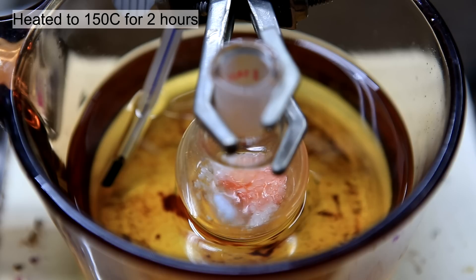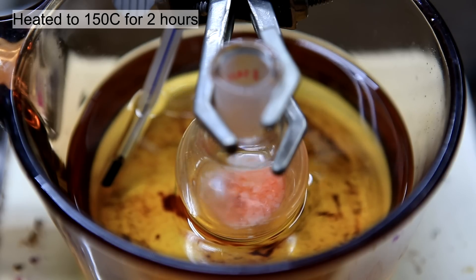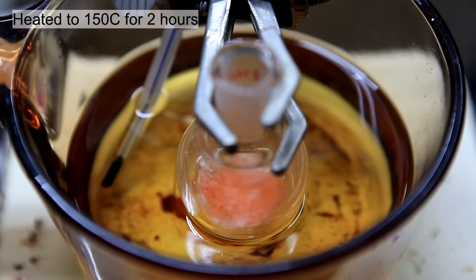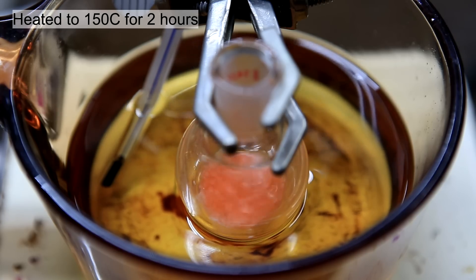As the heat increases, the phenol should melt and the mixture should liquefy. At this point you can already see the red color of phenolphthalein forming.